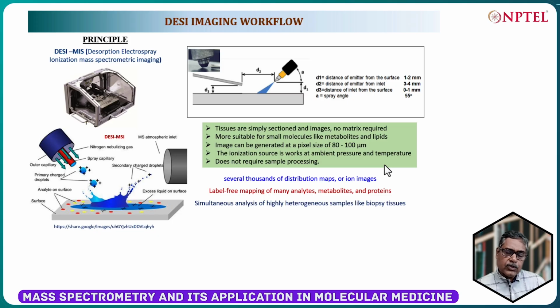The one that we observed in case of MALDI mass spectrometry based imaging of tissues, where we had to remove salts and lipids from the surface first, so that they do not interfere with the ionization of the peptide, and for that we had to take the tissue through a series of solutions. One of them, the important one, is Carnoy's solution, but no such processing is required at all.